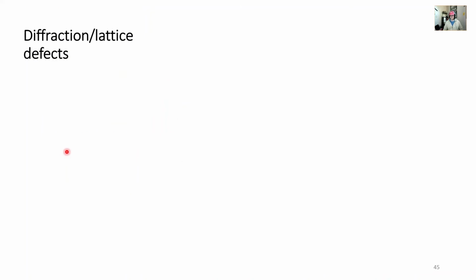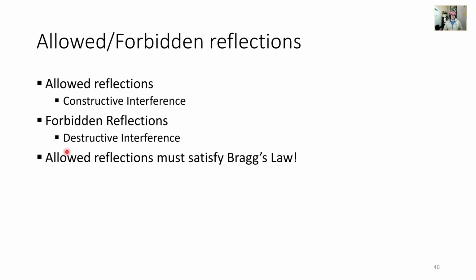All right, so you've seen how electron diffraction occurs from a solid state point of view. We have another solution for Bragg's law, and hopefully that helps make some sense. It's kind of cool that we get another flavor of Bragg's law, not just lambda equals 2d sine theta. The next thing we want to talk about is, so we know things diffract. We've seen this before with XRD, particularly in the XRD lab assignment you all had.